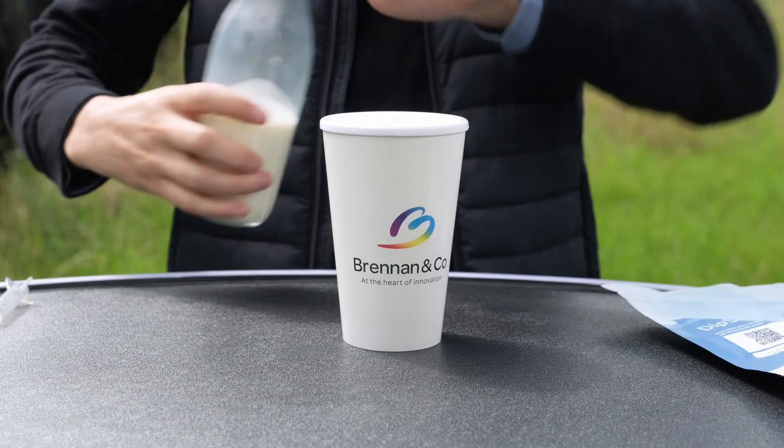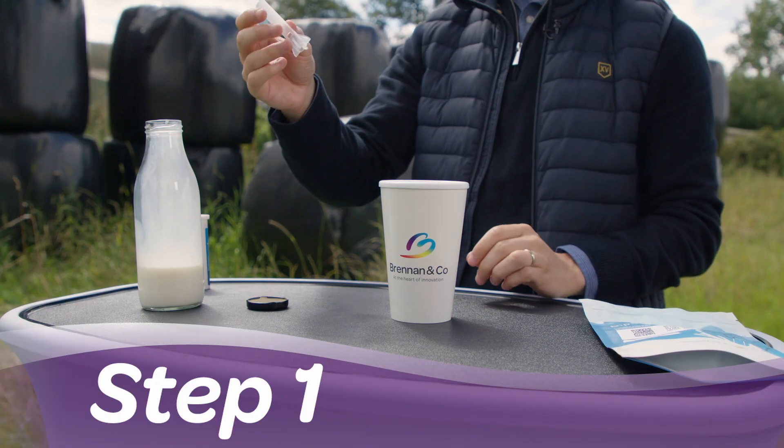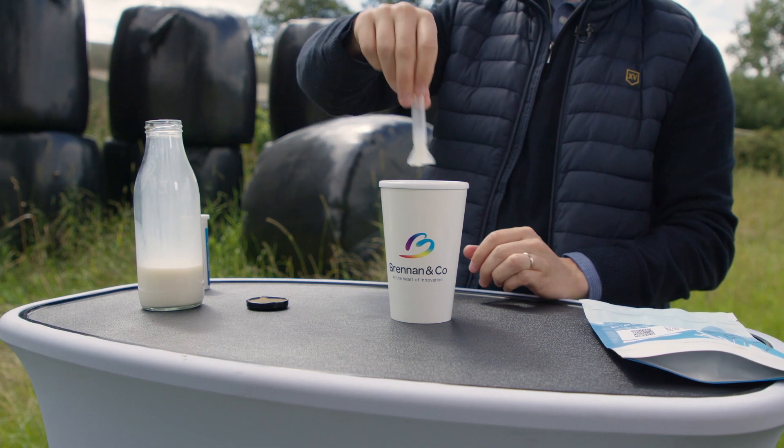Okay, first we're gonna prepare some milk. I'm gonna pour some into a cup here but you can use a jug or whatever you have handy. Step one: first we'll take the dipper and immerse it in the milk. The dippers are handy because they collect just the amount of milk sample that we need for the test.